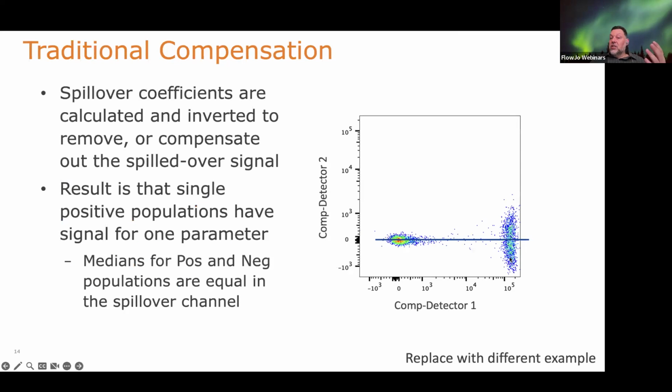After applying the compensation, you do get this phenomenon of spillover spreading. And spreading is part of cytometry. It's innate to the detector system that we use and how we measure fluorescence. We're limited by the noise in the detector that causes this spreading. And we'll talk a little bit more about spreading later on, and how we can evaluate the spread that is going to occur when we combine two colors together in a staining panel.